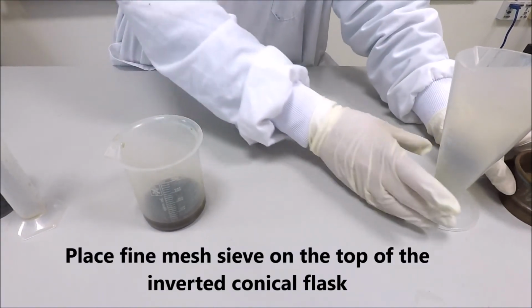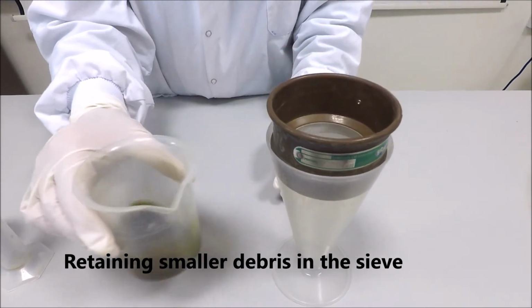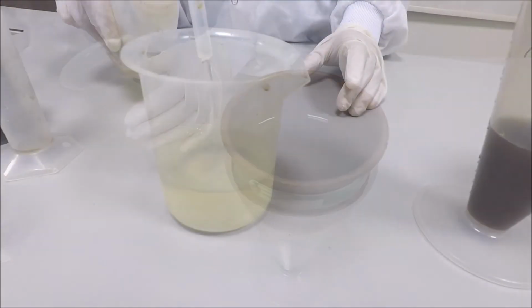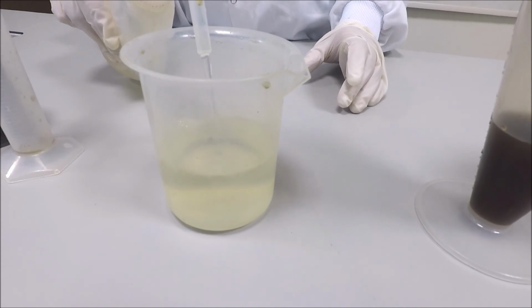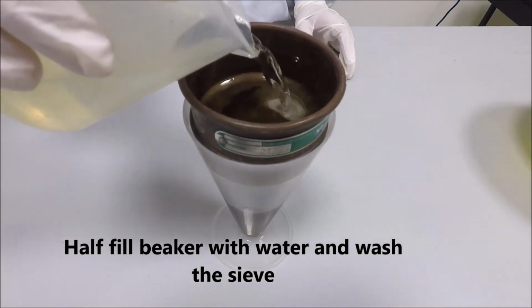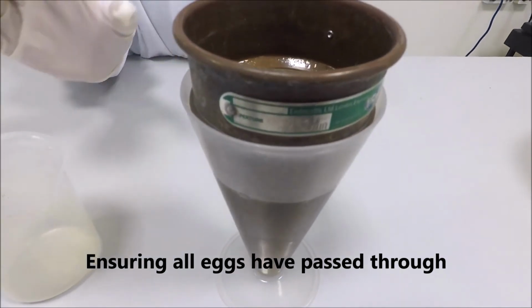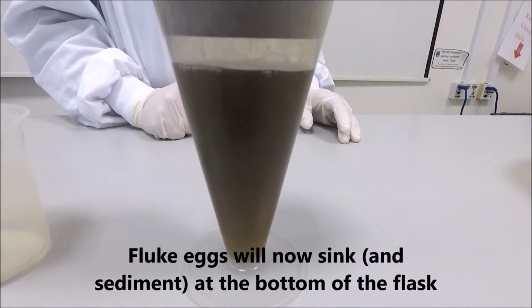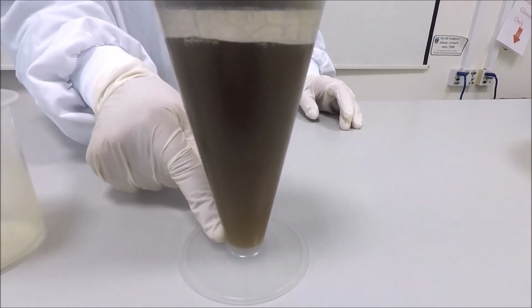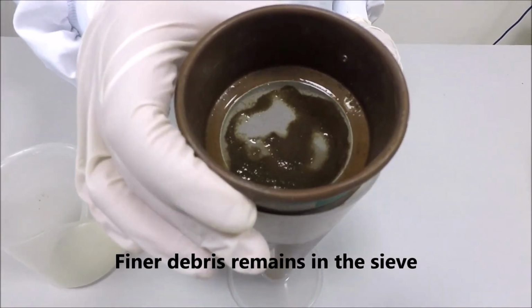Taking your fine mesh sieve, place this on top of your inverted conical flask. Pour your suspension through your sieve. Your eggs will pass through, but the finer debris will remain at the top. To ensure all eggs are passed through, half fill your beaker with water and wash the sieve thoroughly. Fluke eggs will now sink and sediment at the bottom of the flask. And as mentioned, finer debris remains in the sieve at the top.